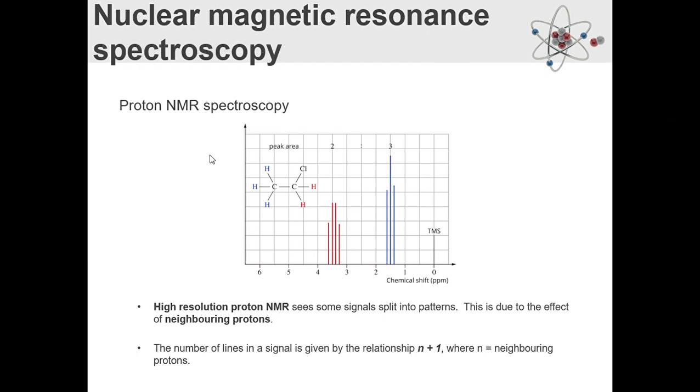It has a really cool bunch of neat things, but what I want to draw your attention to is this 1, 2, 1, where there's 3 things on there. Have a look at this pattern. That's 1, 2, 1. If you look at this 1, 3, 3, 1, it gets split basically the same way that Pascal's triangle would. If you haven't heard of Pascal's triangle, I advise you to look it up in your own time. This is a chemistry video.